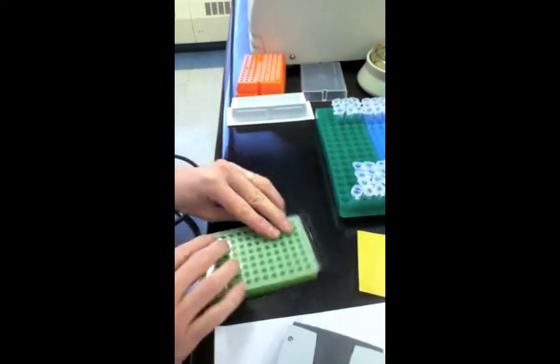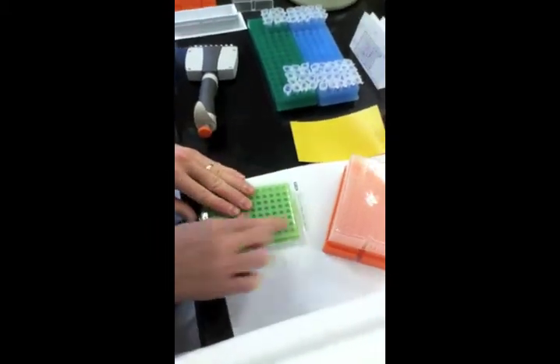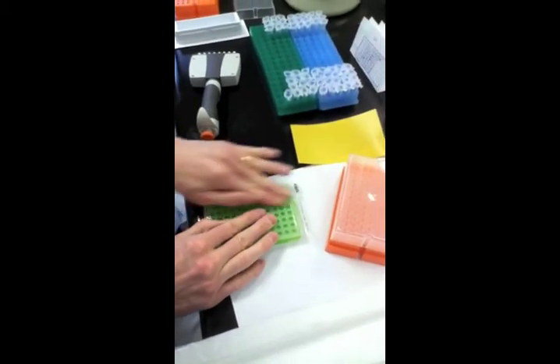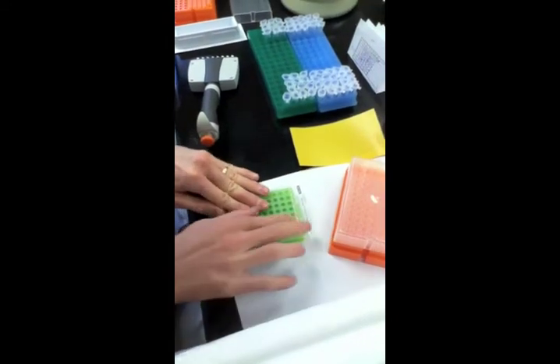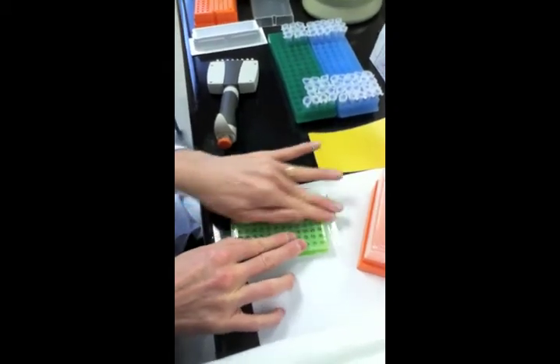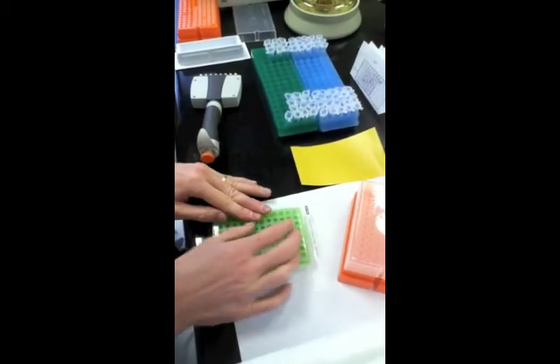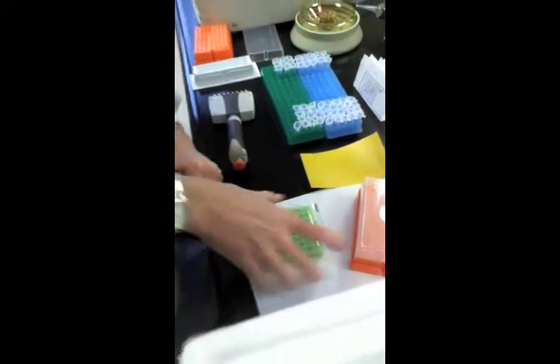This is actually very fancy stuff. It's designed for something else because this adhesive sealer is light transparent, even UV transparent. And that's for doing something called real-time PCR or quantitative real-time PCR. If you want to know more about it, ask me or just Google it. We don't have time in class to talk about it. We got the machine in here, right? Yes, we do. And we're actually doing that experiment with students in third year. So if you stick around, you can do it yourself.